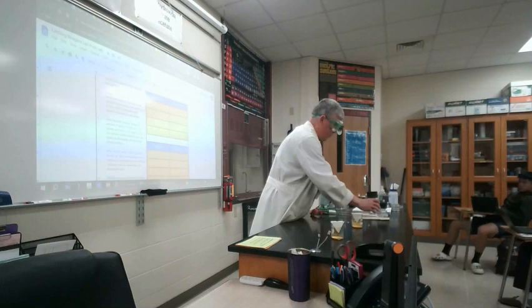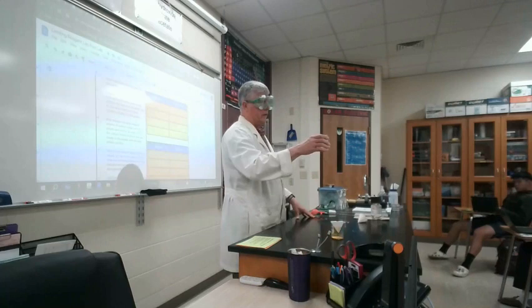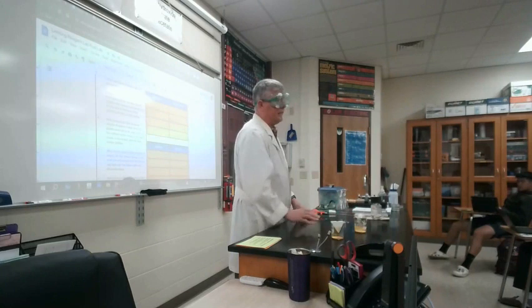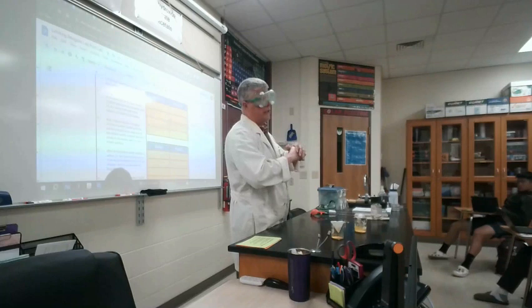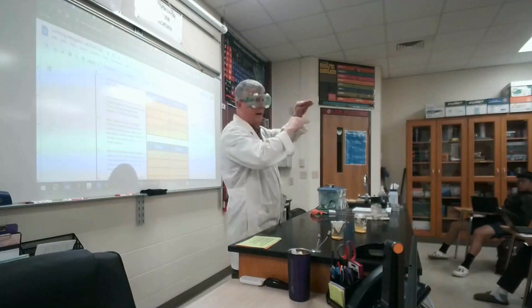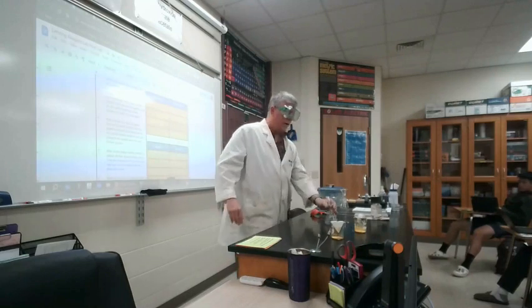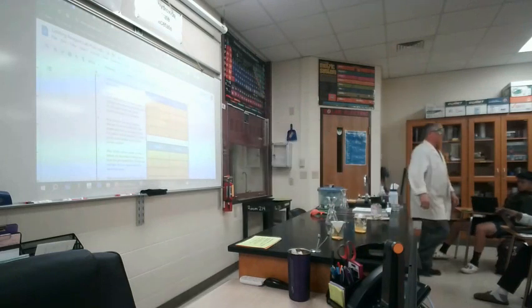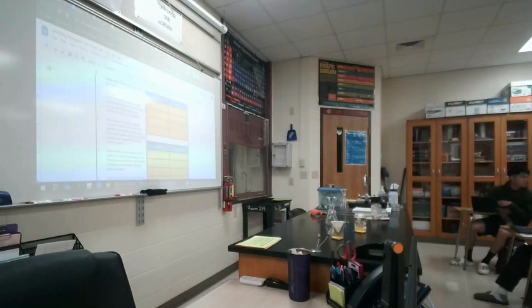Now, remember yesterday, when this stuff is in your container here, swirl it around a little, mix it up, and then let it sit. We want the precipitate, the heavy yellow stuff, to go sit on the bottom. We want the water to be on top. Now, while you are waiting, ladies and gentlemen, you can grab your funnel and your flask. You can grab a piece of filter paper, which are out on the back station here, ladies and gentlemen, along with the glass beakers.